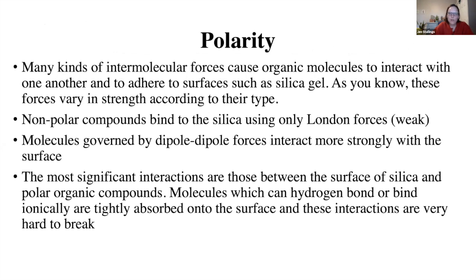All right, so polarity. In the group activity, you have to identify the London forces, dipole-dipole, and hydrogen bonding, because those also have to do with how your spots are going to behave on your TLC plate. It's those intermolecular forces that cause the molecules to move, and which ones are going to adhere to our polar silica gel.